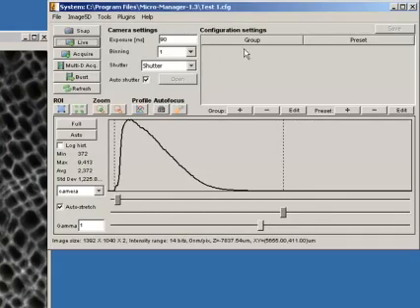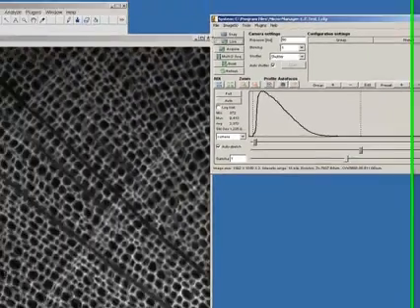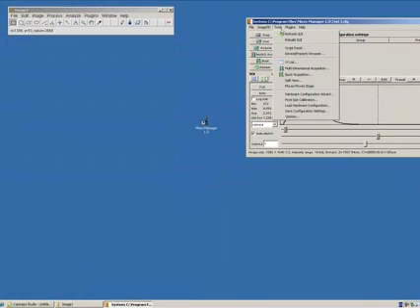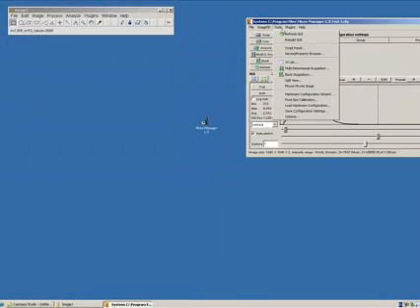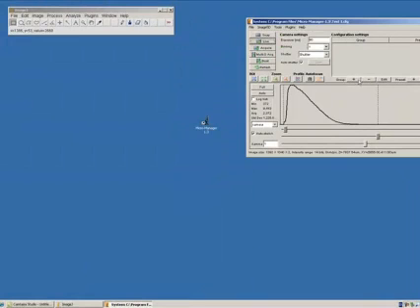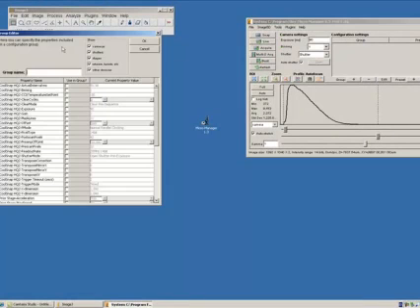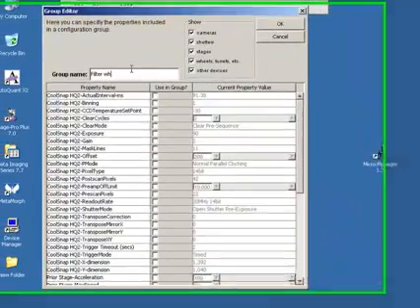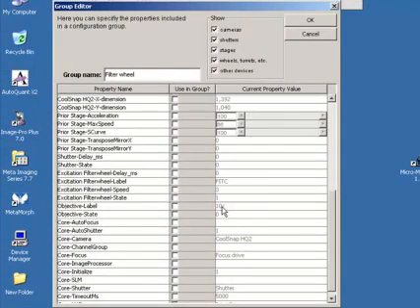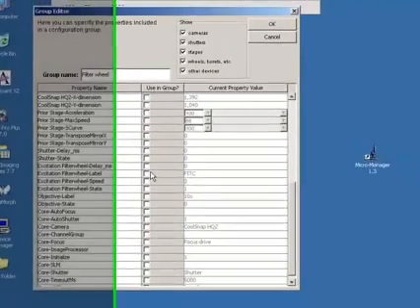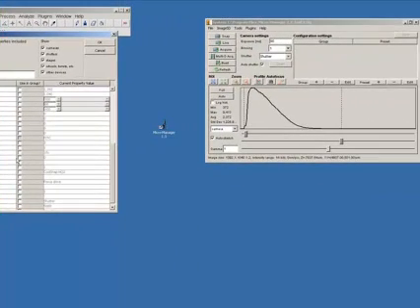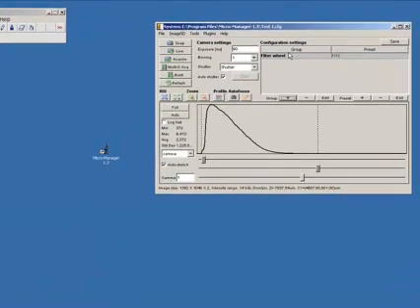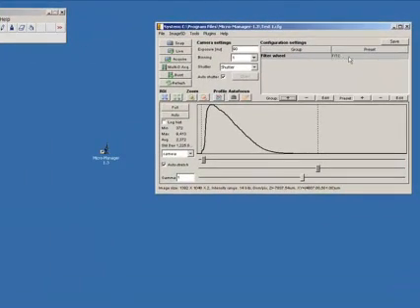So, now I need to define some configuration settings. So, to do that if you come to tools. If we come to here and add a group to start off with. And this one's going to be my filter wheel. And then on our list here you just need to tick what we're going to use in this group. So, obviously we're just going to look to use this to change between our various different excitation filters. So, in here we've got excitation wheel label. So, if I tick that one. And then click OK.